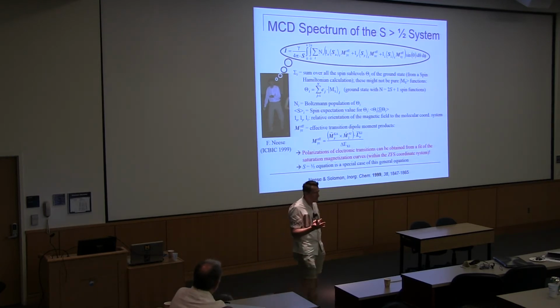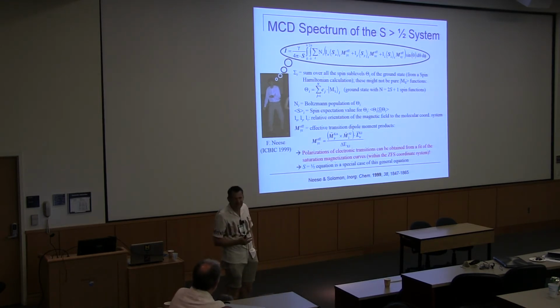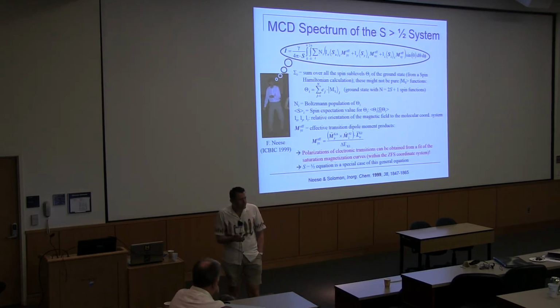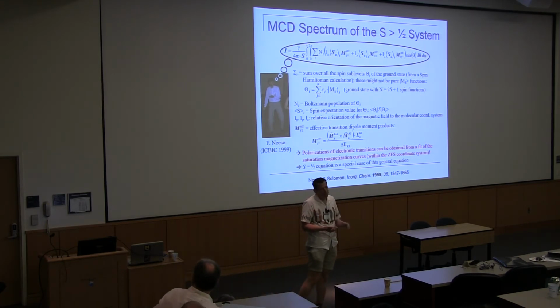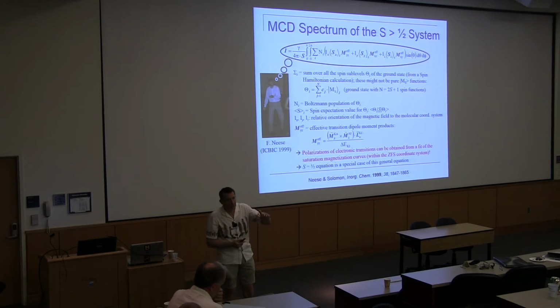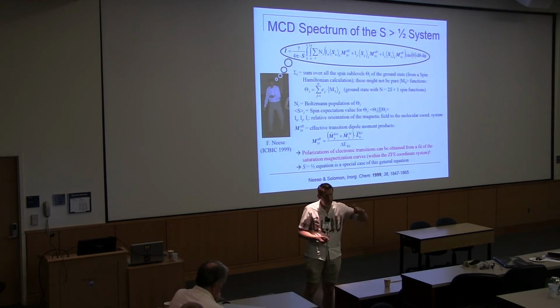So when I say the band is Z-polarized, right, then Z is relative to the Z direction of the zero-field splitting tensor, so you have to know what that orientation is. That, however, you can nowadays calculate with DFT, and DFT oftentimes does a pretty good job in doing this. So you have to do your typical approach: use a couple of functionals, compare the results, and make sure it's all consistent. Especially if you have one predominantly strongly bound ligand with a very covalent bond, oftentimes the Z direction aligns with that particular bond, like in an iron(IV) oxo or some iron nitrosyl compound, then oftentimes you see that that is the Z direction.